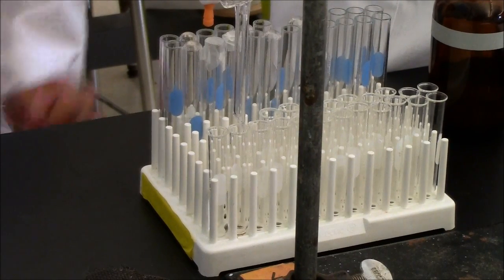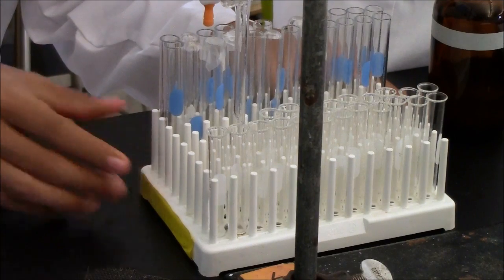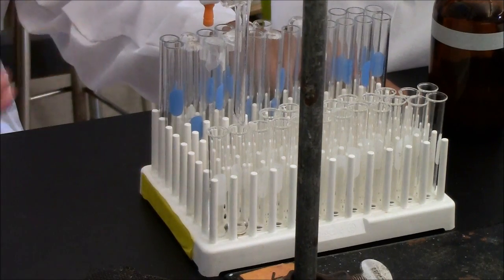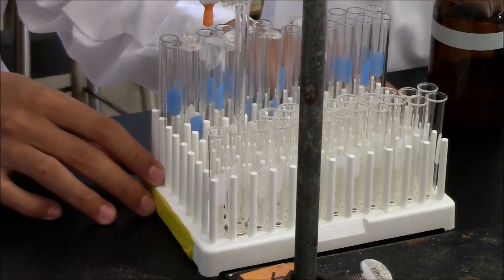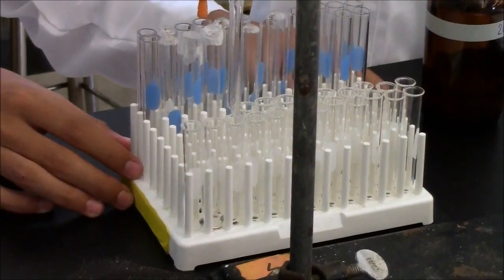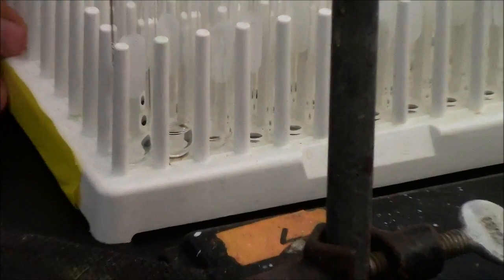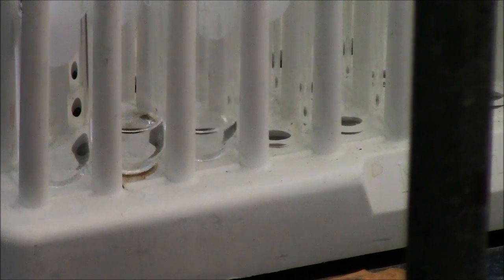All right, so what we'll want to do next is prepare. So, after this amount, I should just move it over again, right? Yeah, that's a good size fraction. All right, so that is a reasonable sized fraction there, and we're collecting the second series fraction, the third total fraction.